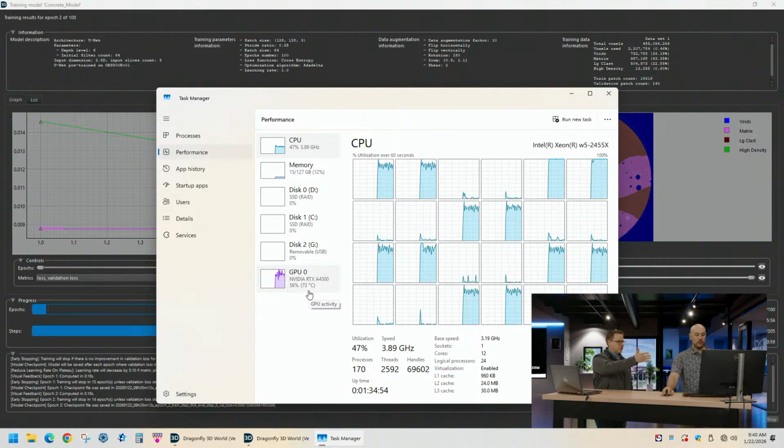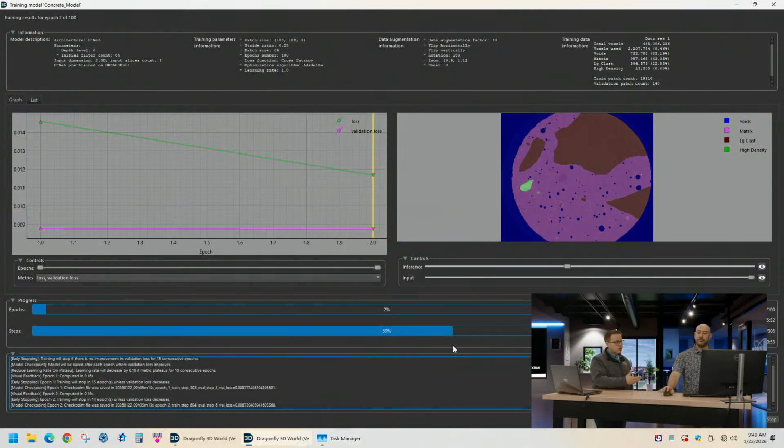What we're seeing here is it hits it heavy. We got that GPU really being used. The CPU is being used too. So this takes a lot of power. Don't try doing this on the old laptop. Well, you can do it, but it'll just take longer. If you're going to do that, you probably need to downsize your data set or use a subset of your data. But yeah, it is definitely very computer intensive, or it can be anyway.